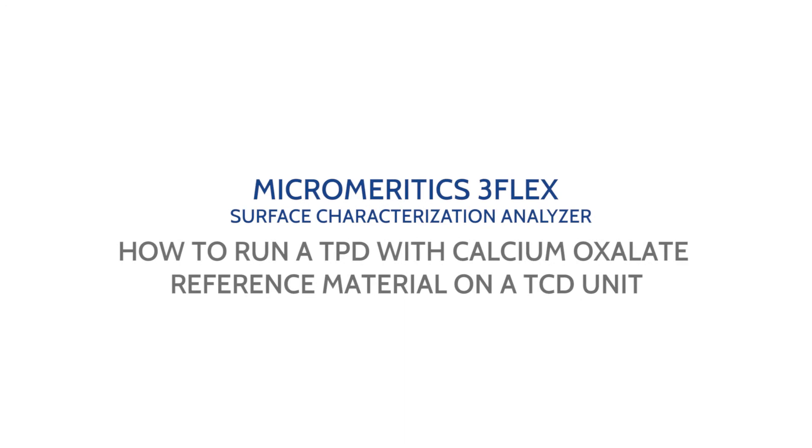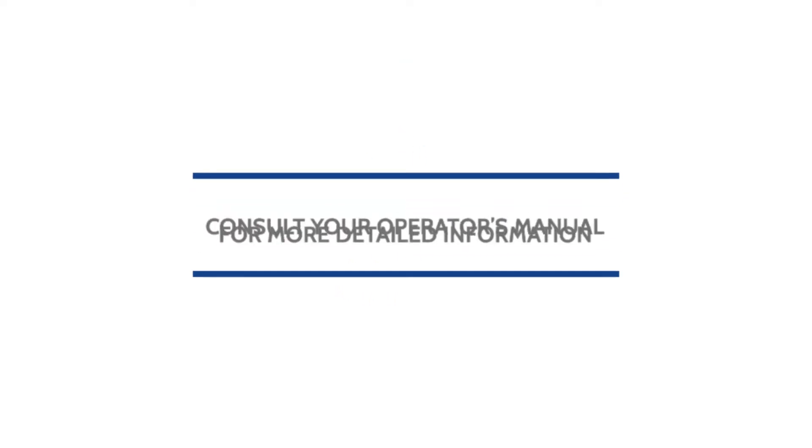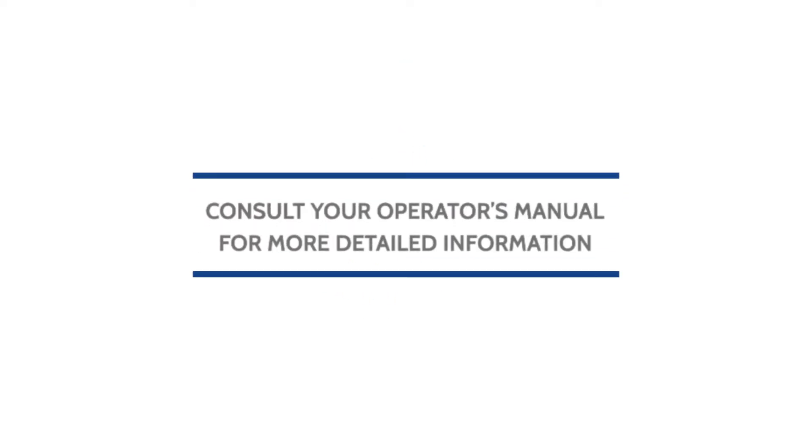This video will show you how to run a temperature programmed desorption with calcium oxalate reference material on the Micromeridix 3-Flex Surface Characterization Analyzer with TCD. Remember to always consult your operator's manual for more detailed information.